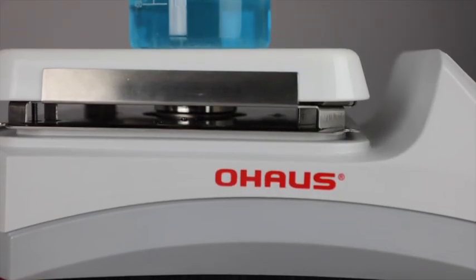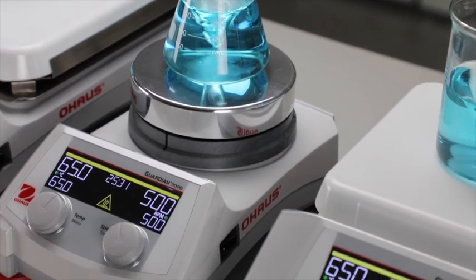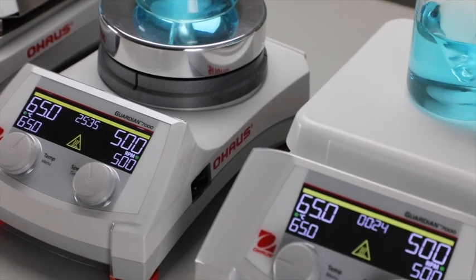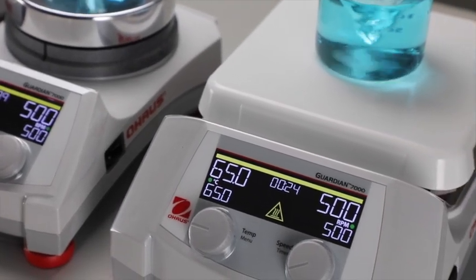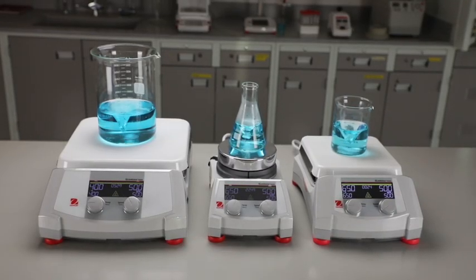Guardian 7000 series hot plate stirrers feature powerful, consistent stirring performance. Precise stirring from 60 to 1600 rpm is made possible by the design of a powerful motor, strong magnet, and software-controlled ramp rate, ensuring secure magnetic coupling for viscous applications.